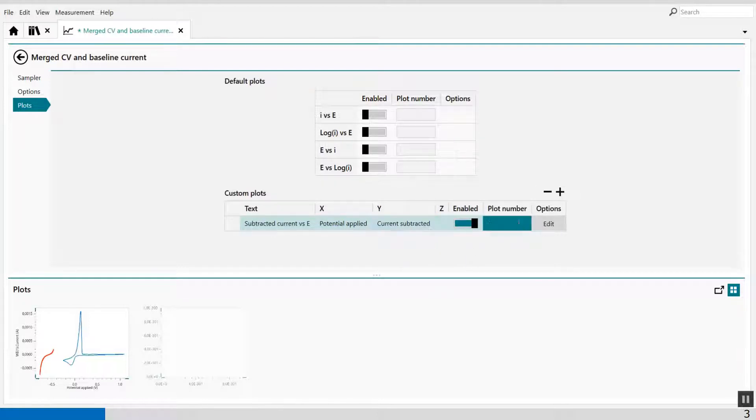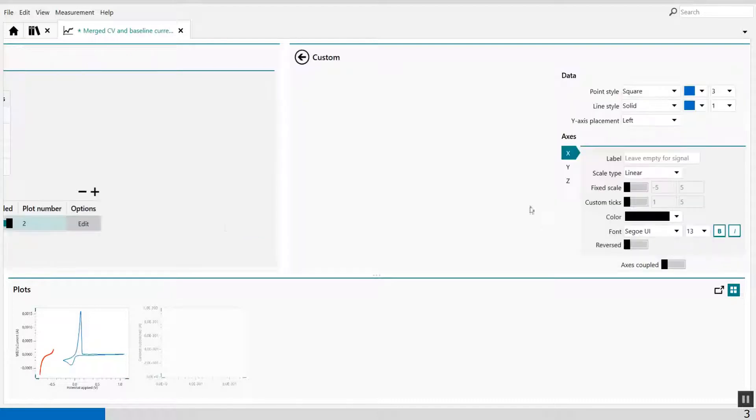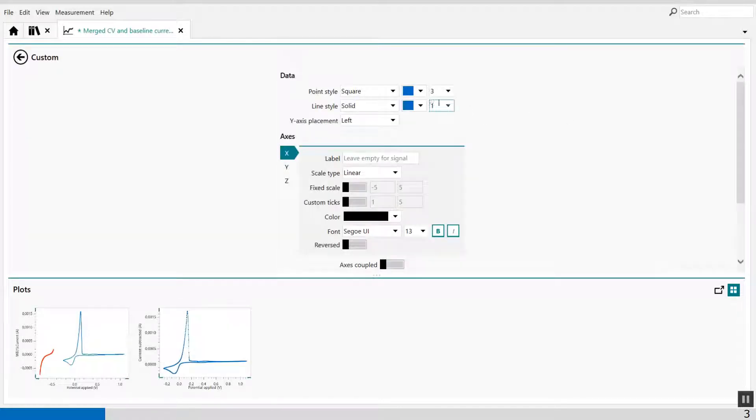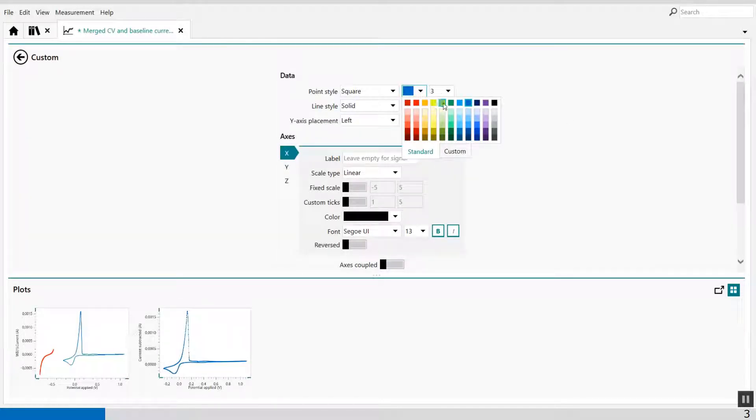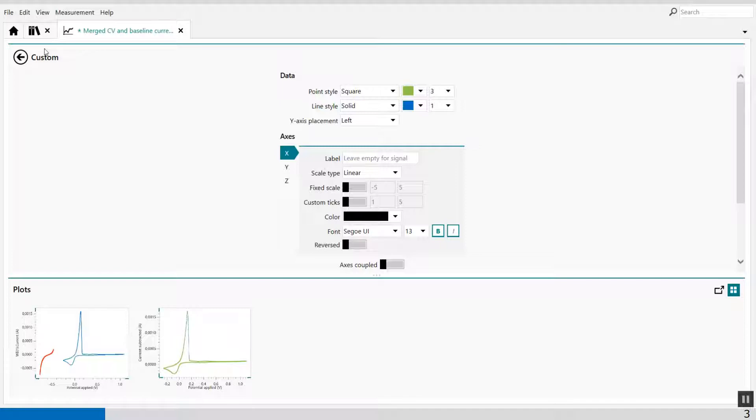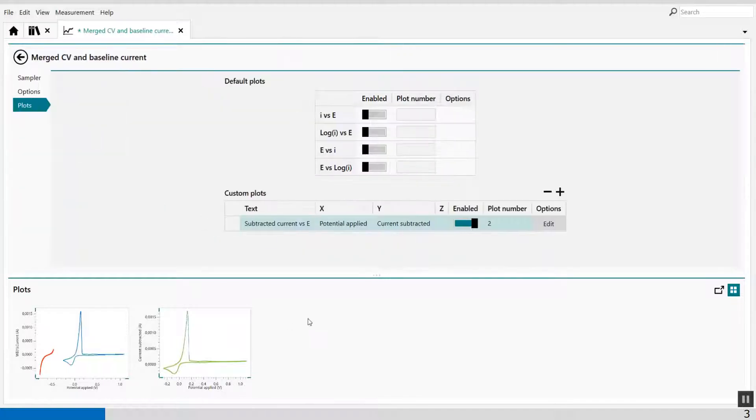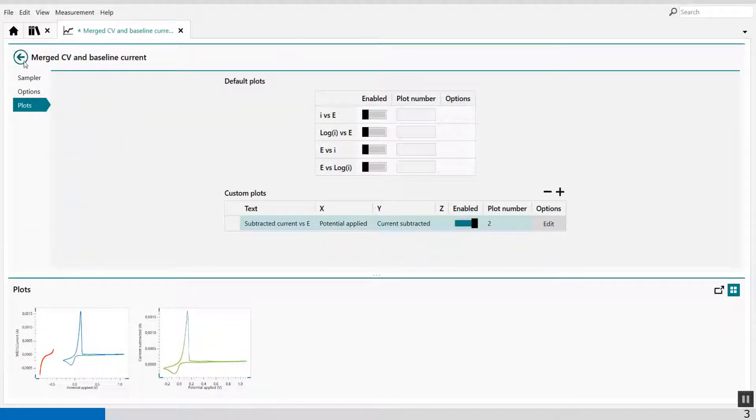And I can show it in plot number 2. Make it green. Like this. So this is my subtracted CV.